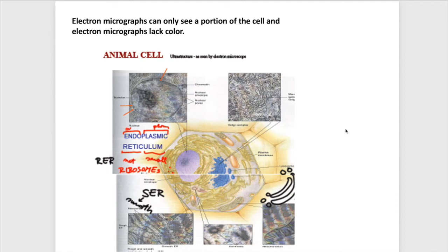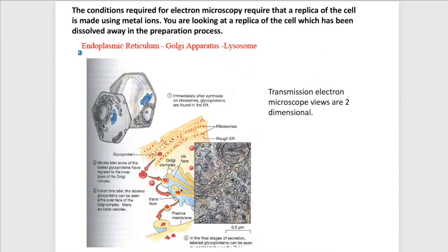So again, very useful. I can get the kind of information that I cannot get with the light microscope or with the scanning electron microscope. And this is the transmission electron microscope. Here, I can look at pieces of the membrane and pieces of the endoplasmic reticulum. These pictures in the transmission microscope are all two-dimensional. I can't look at 3 dimensions like I can with the scanner, but I can look at much higher power.